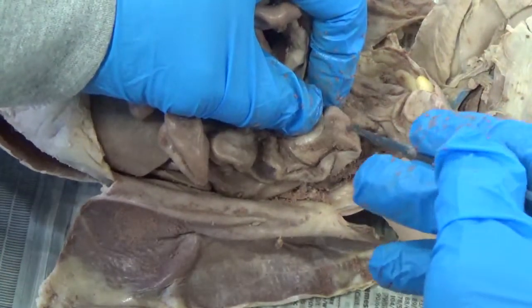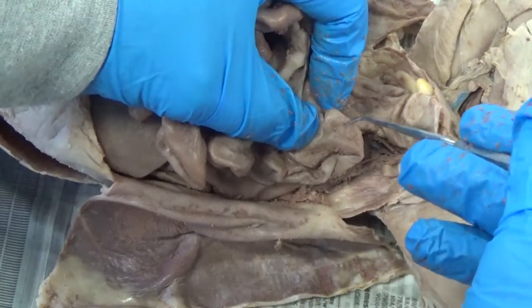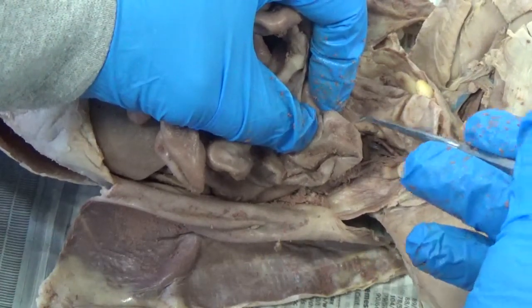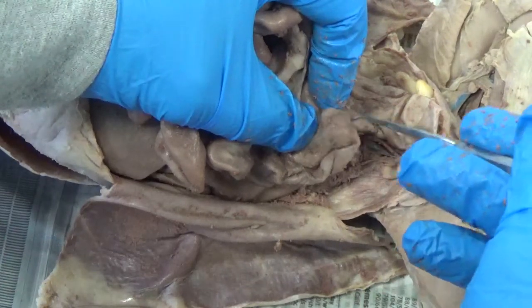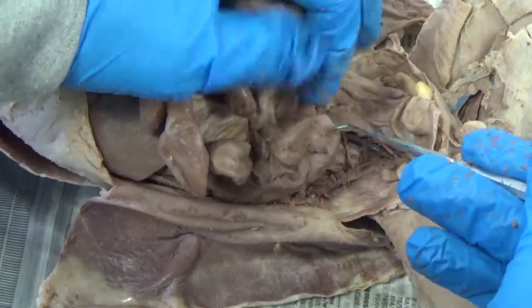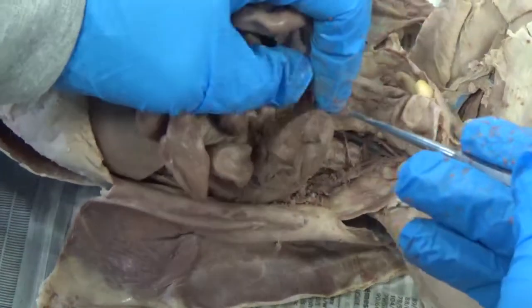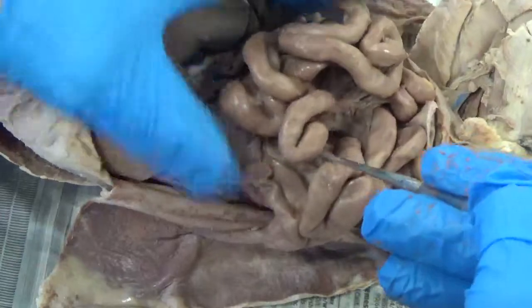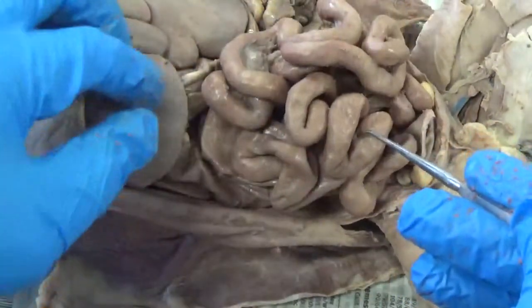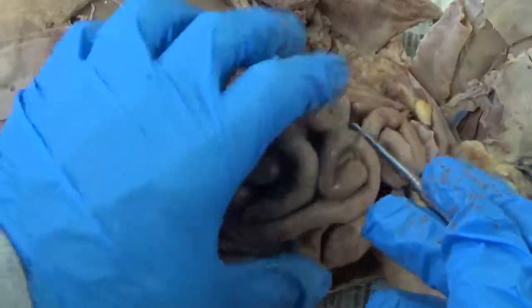Anyway, so in humans, hanging off of the cecum right about here would be a small finger-like projection called the appendix. Cats don't have one. Okay, so that's one difference between a cat and a human, is that they don't have an appendix. The appendix is a vestigial organ. Nobody really knows what it was used for. It just has no use anymore.